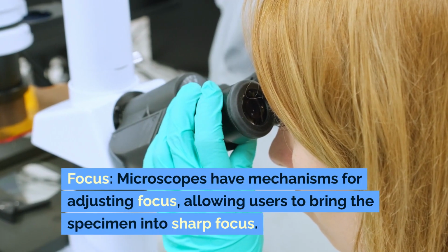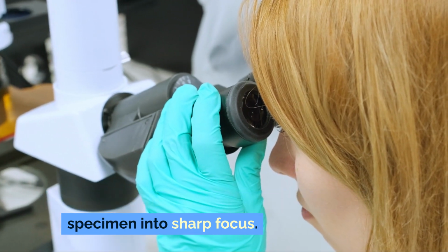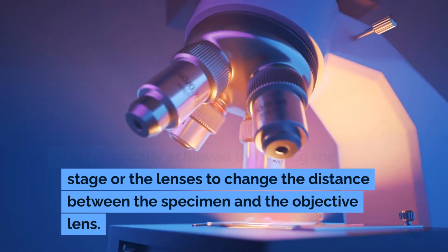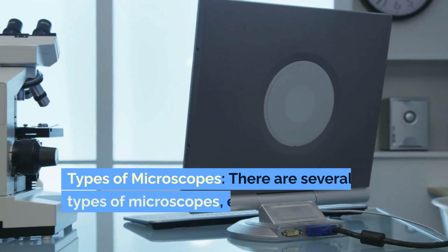Focus. Microscopes have mechanisms for adjusting focus, allowing users to bring the specimen into sharp focus. This is typically achieved by moving the stage or the lenses to change the distance between the specimen and the objective lens.